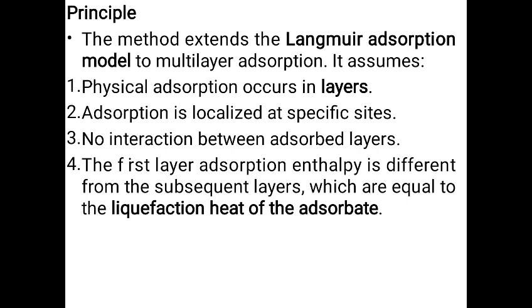Principle. This method extends the Langmuir adsorption model to multi-layer adsorption. It assumes physical adsorption occurs in layers. Adsorption is localized at specific sites and there is no interaction between the adsorbed layers. The first layer adsorption enthalpy is different from the subsequent layers, which are equal to the liquefaction heat of the adsorbate.